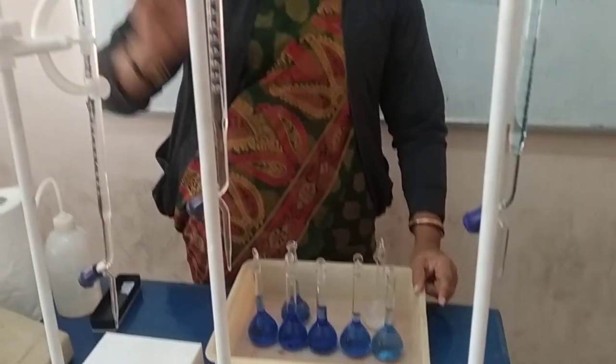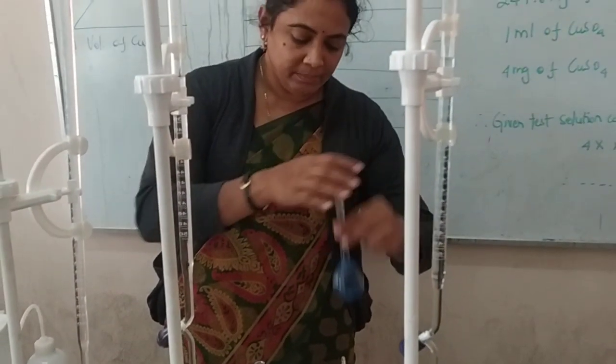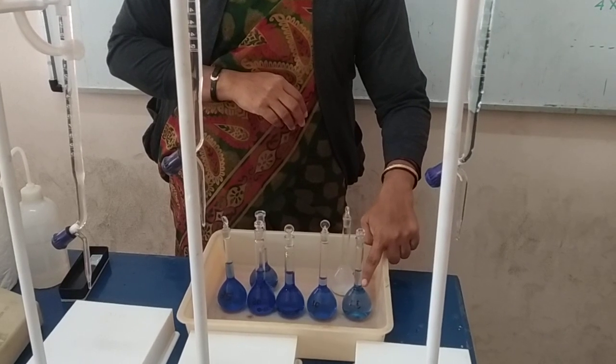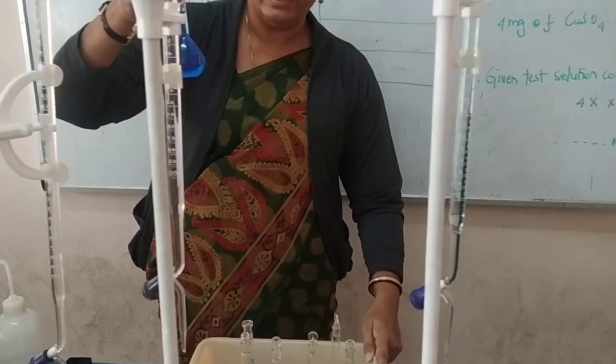Finally, you have to make up the solution with distilled water, mix well, and keep the solutions ready. When you prepare the solutions, they will look like this — the lower the concentration of copper, the lighter the color, and the higher the concentration, the darker the color.